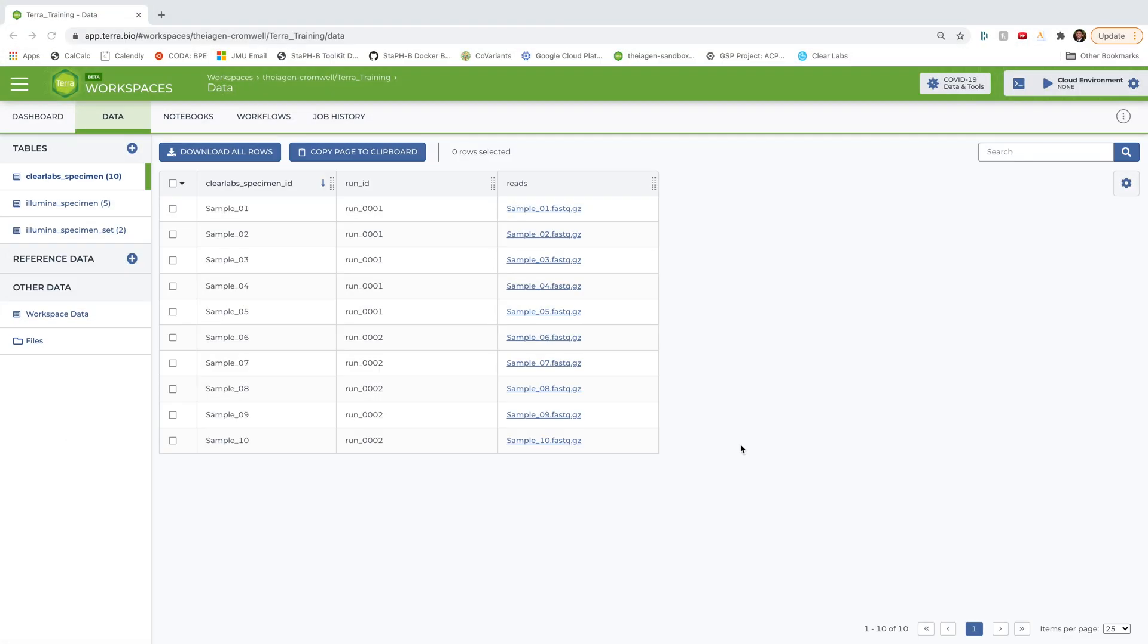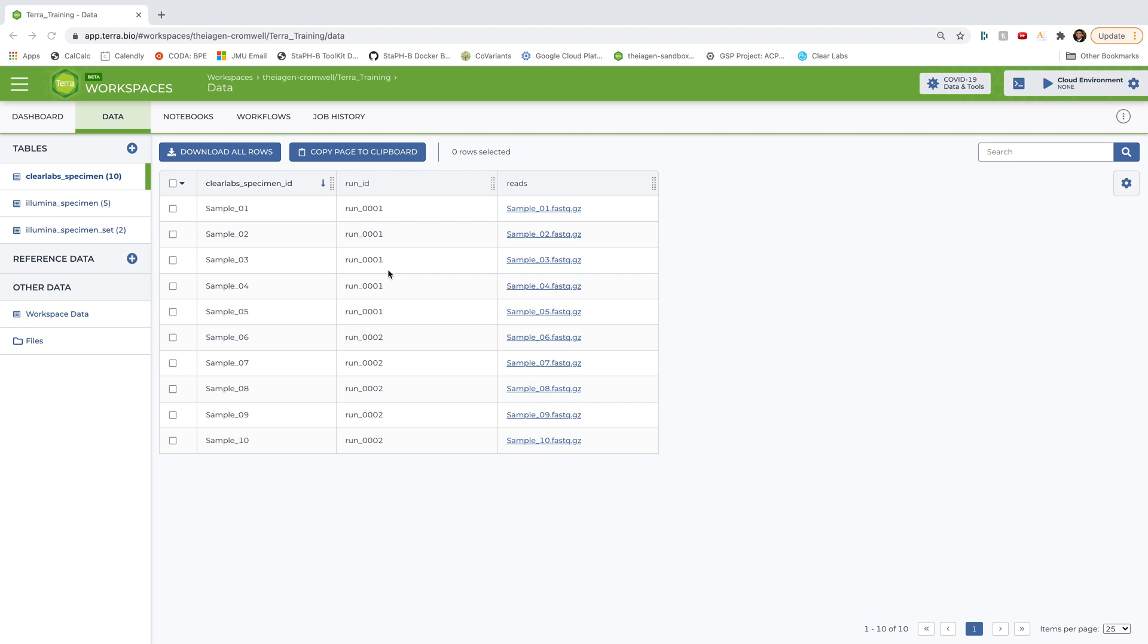Okay, so now we are in our Terra training workspace, and you can see here that I've got a table of 10 SARS-CoV-2 samples loaded into my workspace in this Clear Labs specimen table. And you can see that these 10 samples are associated with two different run IDs, run 0001 and run 0002. In this video, I only want to run the Titan Clear Labs workflow for samples coming off of run 1. So let's keep that in mind when we start defining inputs and outputs for this workflow.